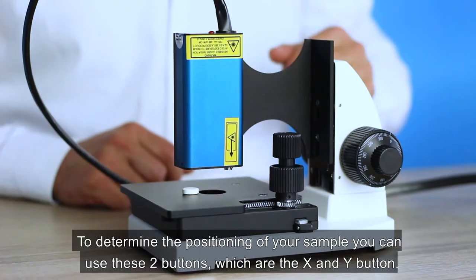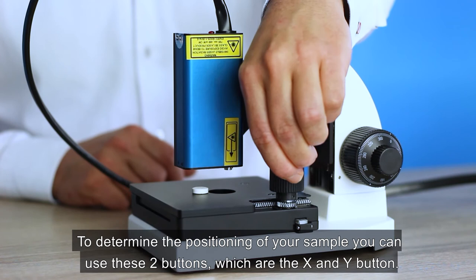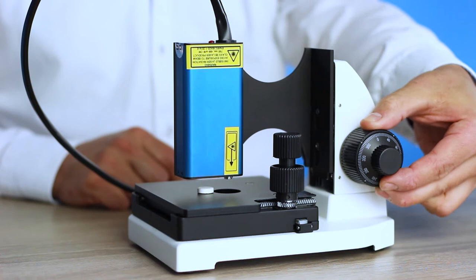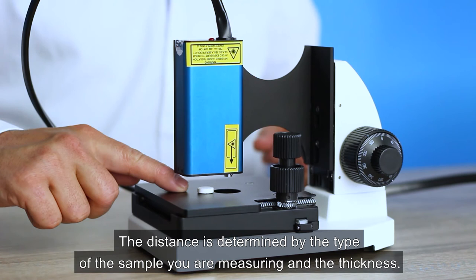To determine the positioning of your sample, you can use these two buttons, which are the X and Y button. If you want to change the distance of the laser towards your sample, you can use this button, which is the Z button. The distance is determined by the type of the sample you are measuring and the thickness.